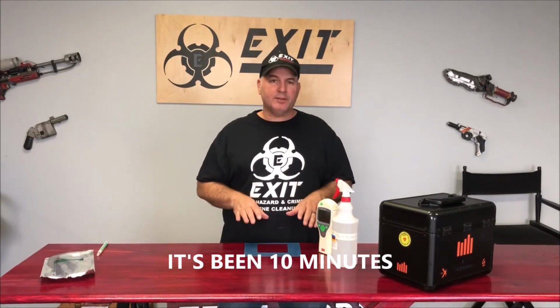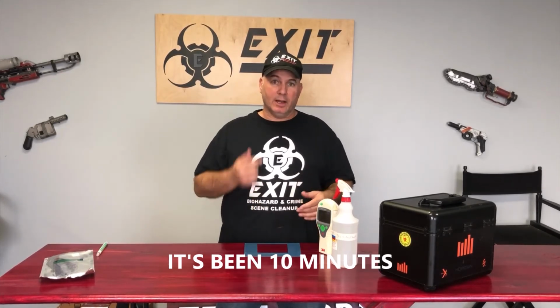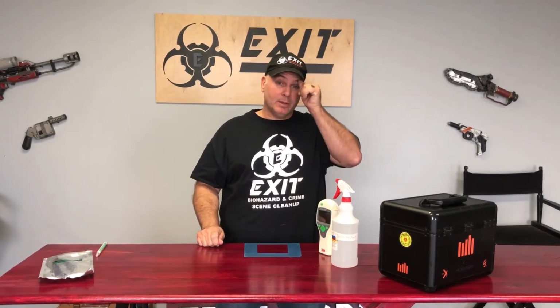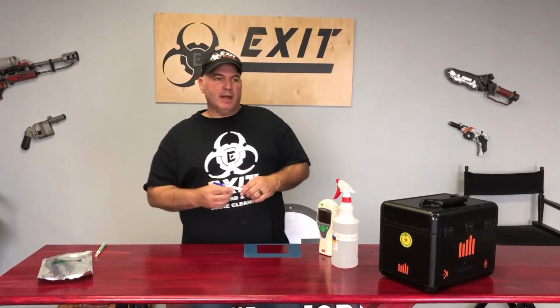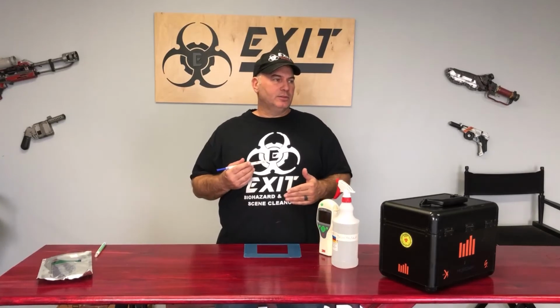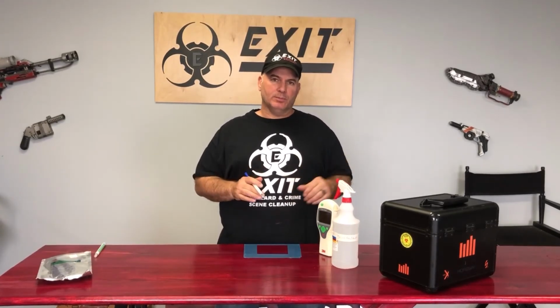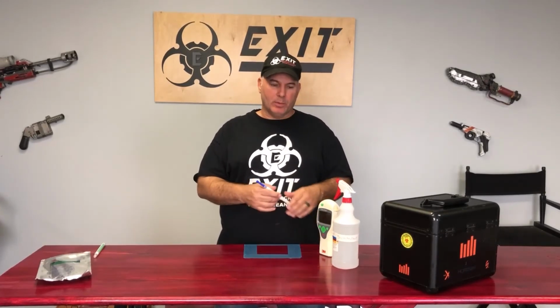Okay, so I've applied some disinfectant to this area and I let it dry, okay? One of the things about our disinfectants are they have a dwell time of roughly 2 minutes. I let it sit a little longer. Basically, that means that it has to sit that long in order for it to kill all the germs and the things it's supposed to do. That's what disinfectants do. So we're going to test this area one more time.